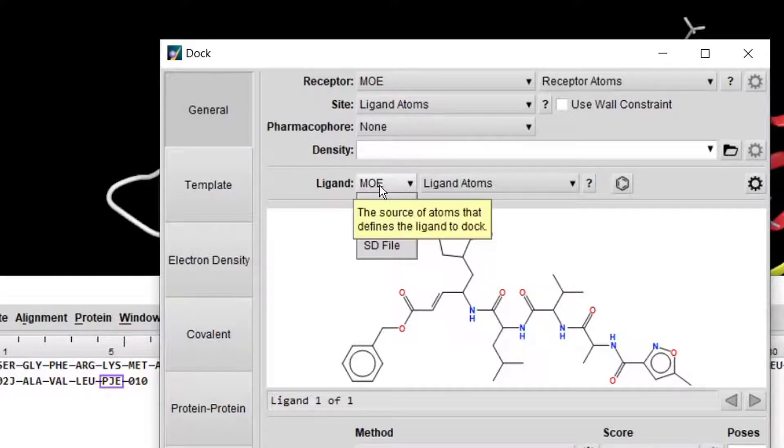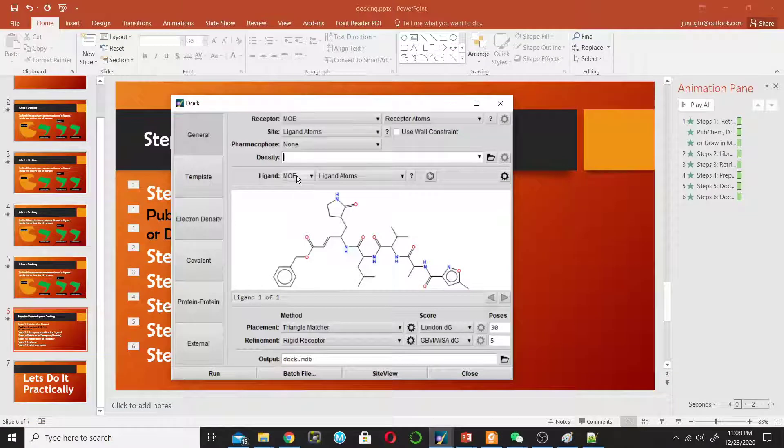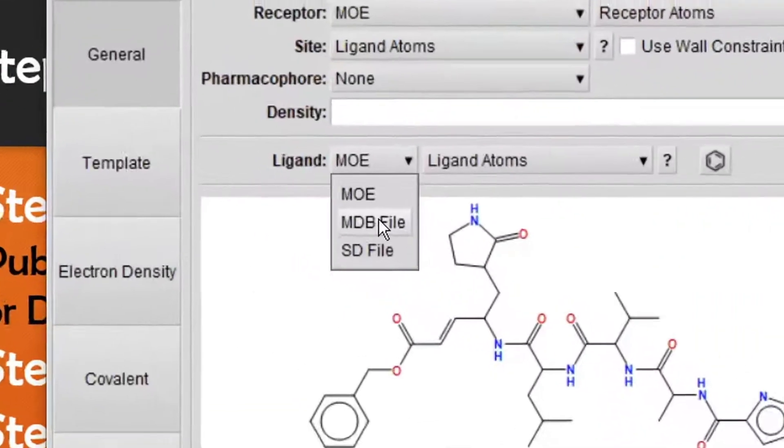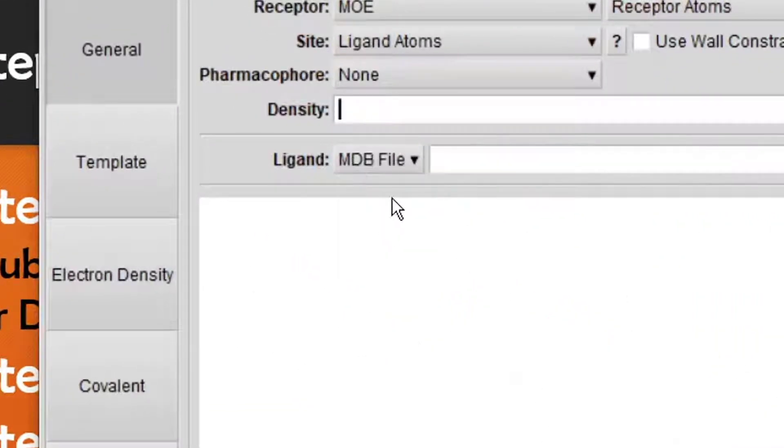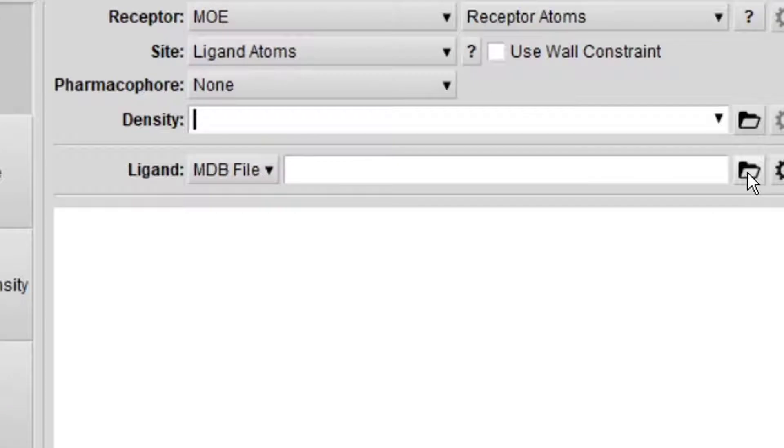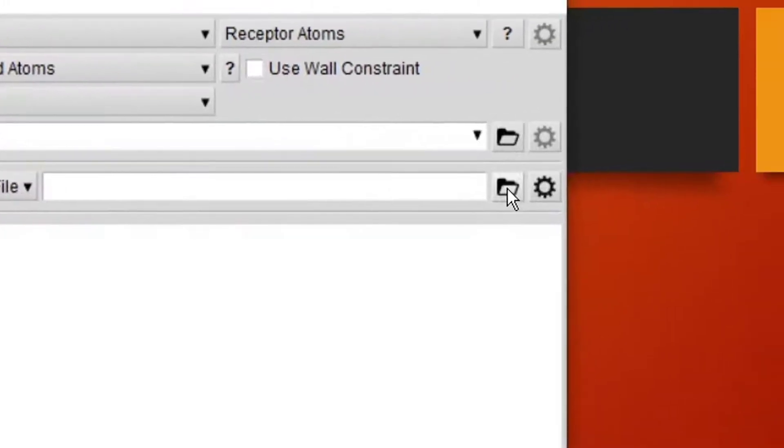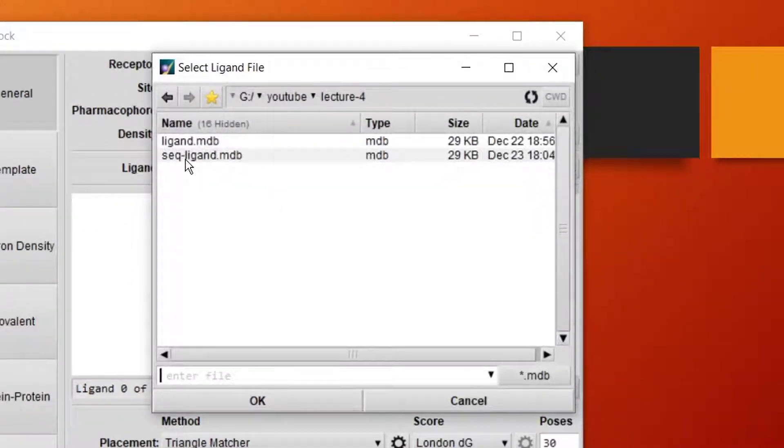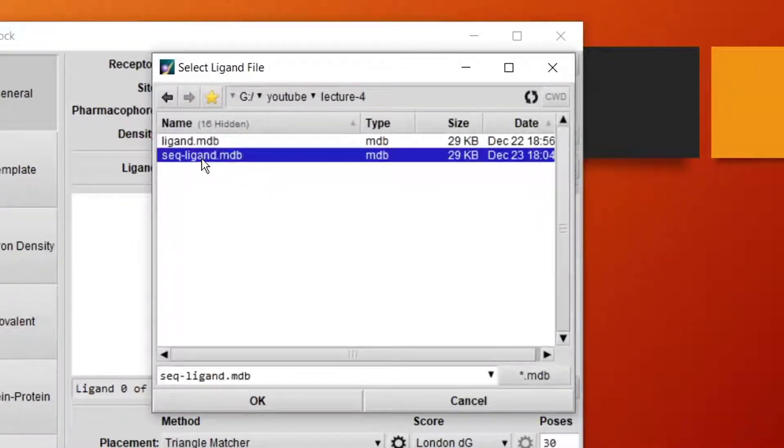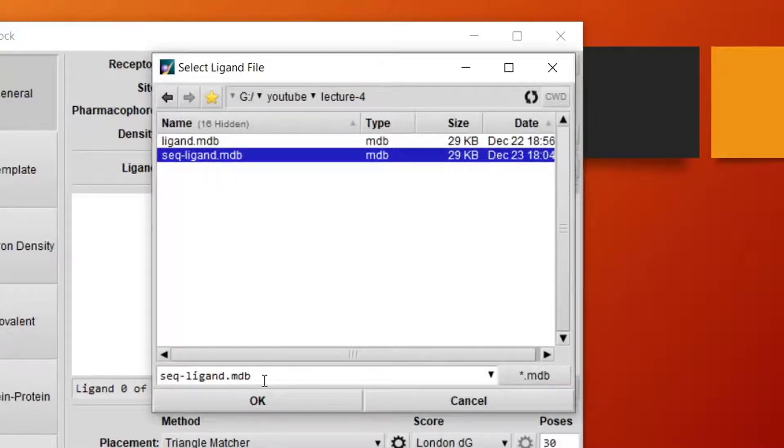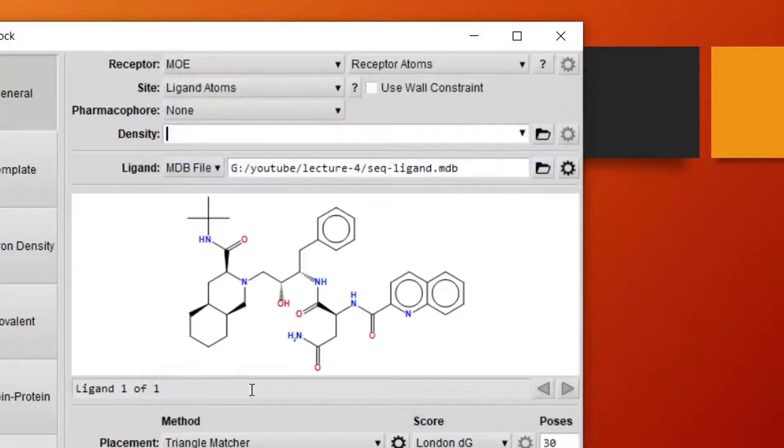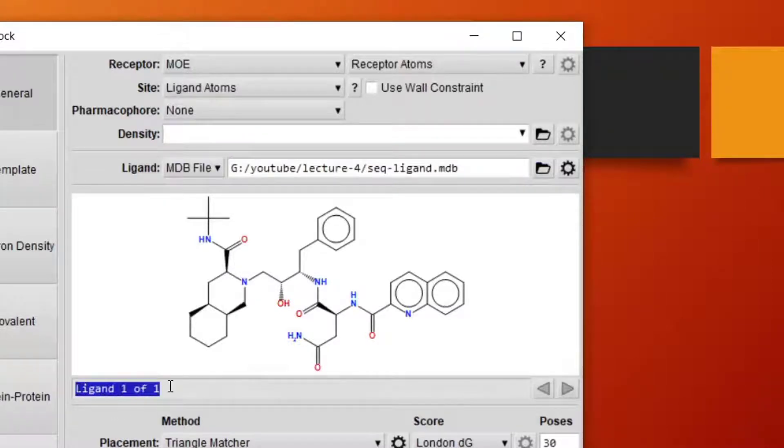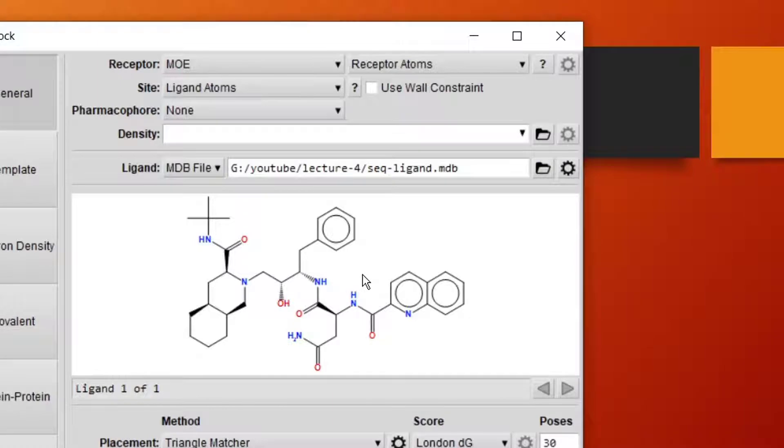Leave Density as blank. For Ligand, we have previously created the ligand database in Step 2, so change this to MDB and browse for the database. This is the database I created in Step 2. Click OK. It will show you that this database has only one ligand. Your database may contain 10 ligands, 100 ligands, and so on.